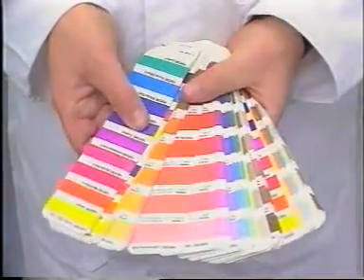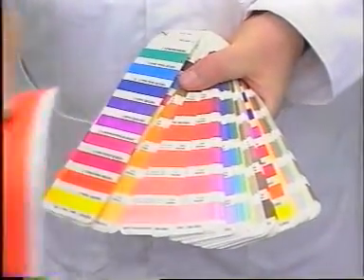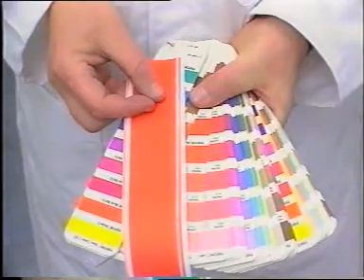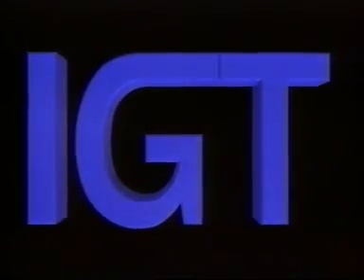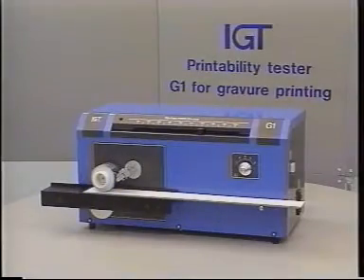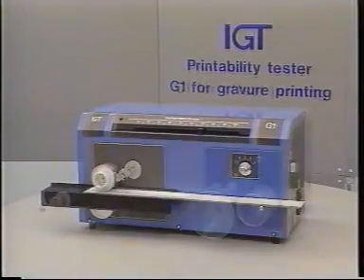The print made can be used for visual, spectrophotometric or other kinds of appraisal. In addition to the F1, IGT can also provide the G1 and C1.